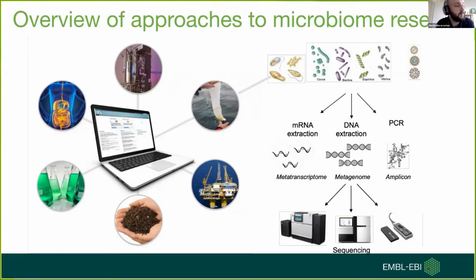This has been shifting over the past few years with the introduction of different DNA sequencing technologies that are more powerful and less expensive. So, for example, one may be interested in sequencing all the DNA in a sample, not just the prokaryote fraction. Or one is interested in analyzing all the viruses there. So you can do that now. It's easier to do.